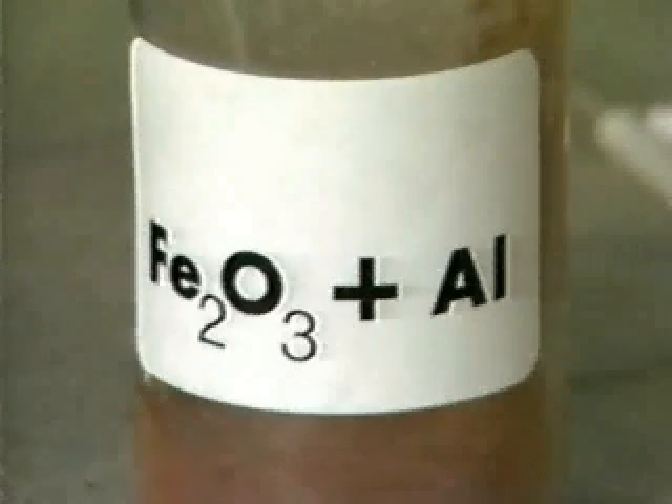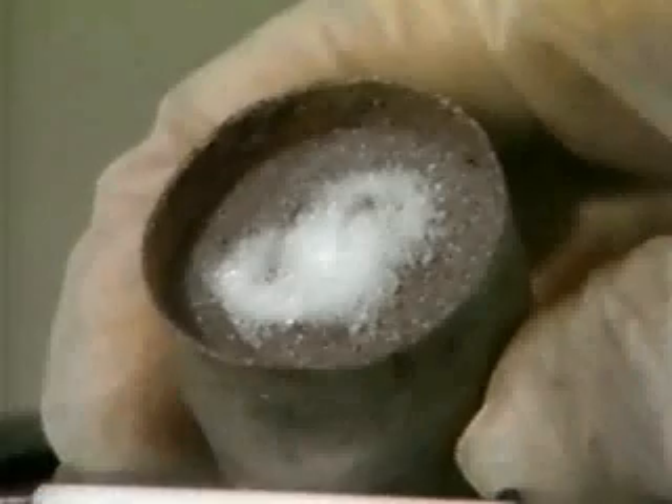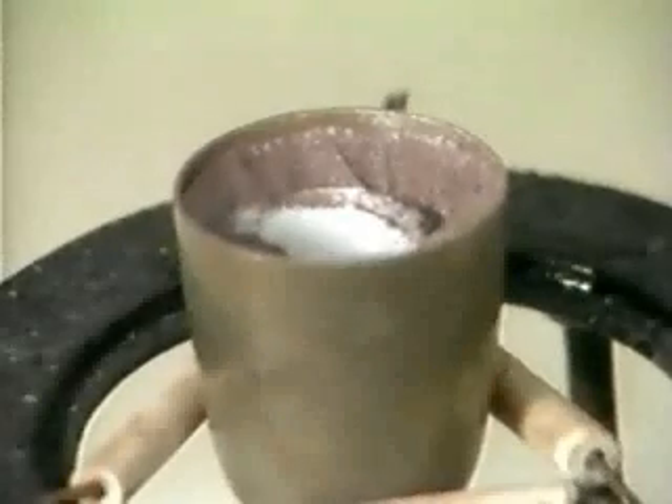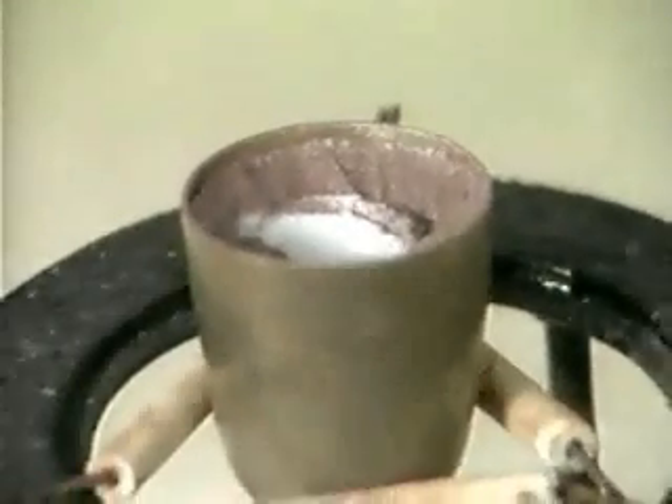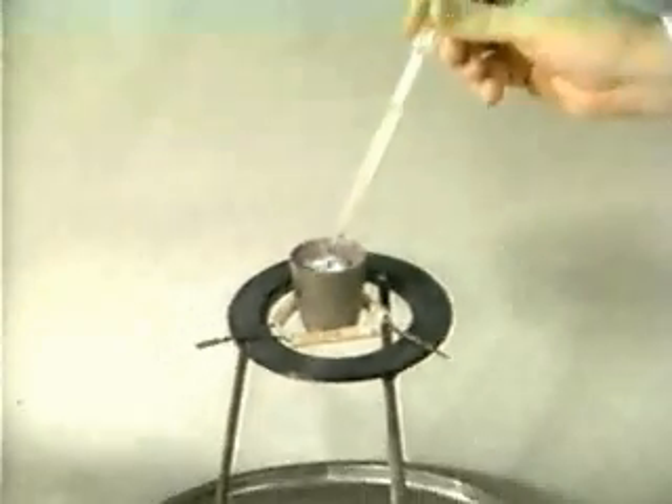A metal crucible is filled with iron oxide and aluminum. A small amount of a white mixture of potassium chlorate and sugar is placed on top of the iron oxide-aluminum mixture. A few drops of concentrated sulfuric acid are added to the chlorate-sugar mixture to start the reaction.